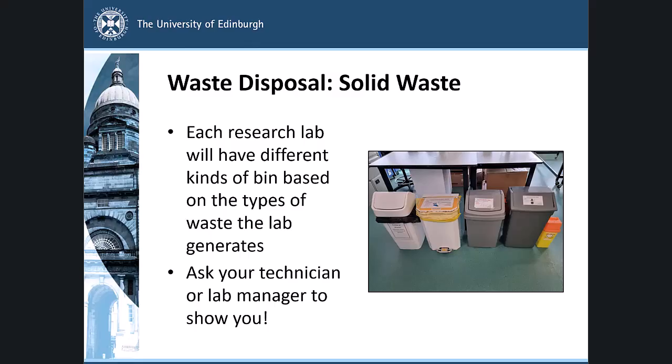For example, if you wash your hands, the paper towels that you use should go in the general waste, as this has a lower carbon cost than hazardous waste. However, if you use paper towels to wipe up a chemical spill in your lab, this should be treated as hazardous waste. You should ask your technician or lab manager to show you the different solid waste streams for your lab and what wastes should go where.